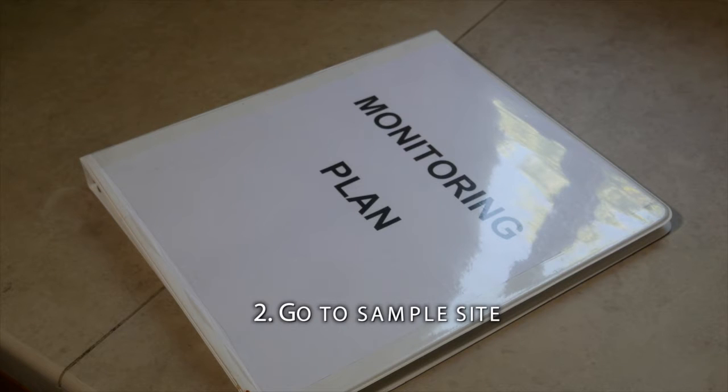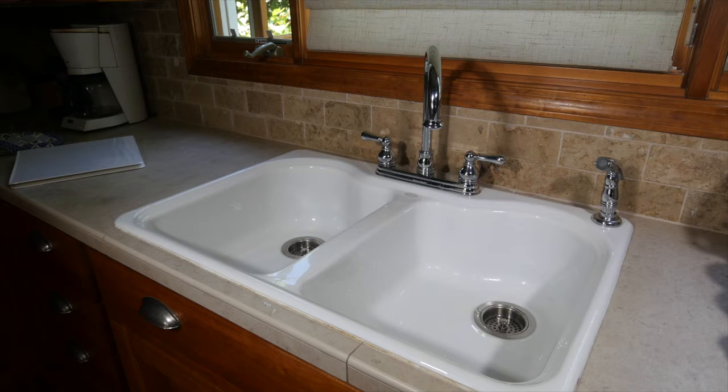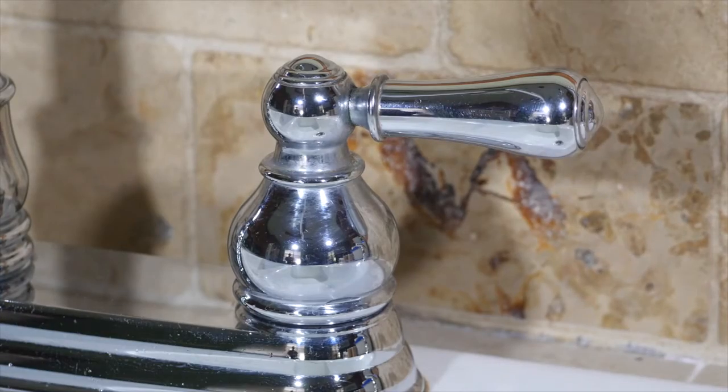Go to the sample site or sites in your monitoring plan. The ideal tap should be clean, in good repair, and free of attachments. It should have separate valves that control the hot and cold water independently. You want to sample only the cold water.